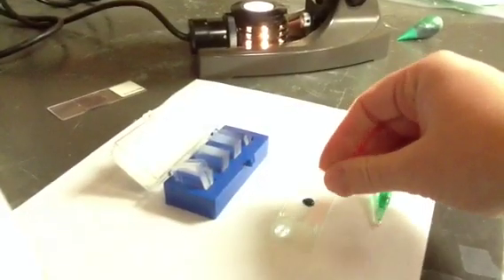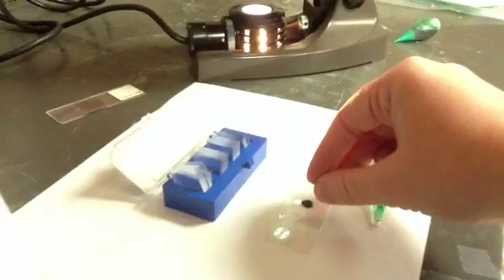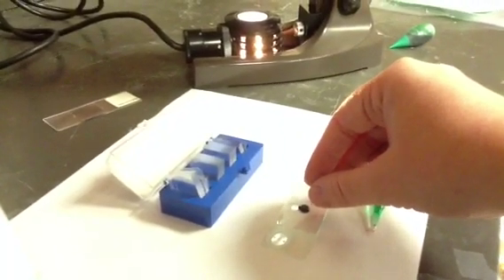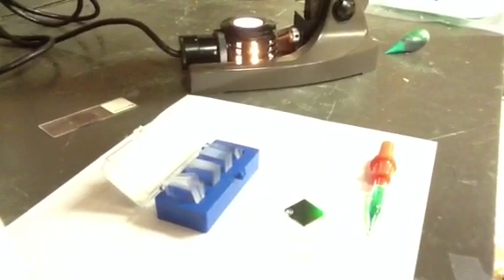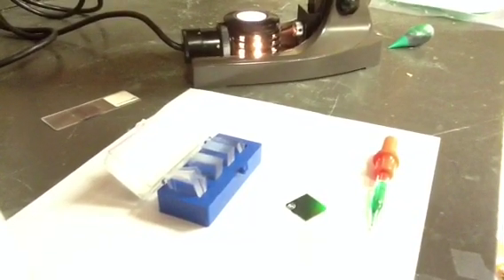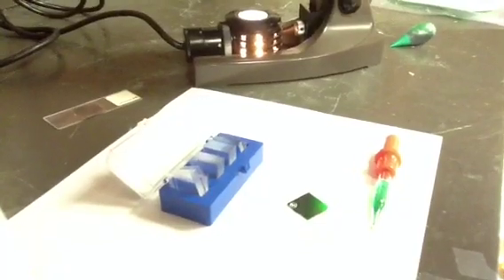It's important that you drop your cover slip at an angle instead of just straight on in order to get rid of air bubbles. Place the edge of your cover slip so it touches the slide, then let go of it. You can see the liquid that was underneath spread out. If you get too much liquid on there, it'll ooze out from underneath your cover slip. It also may make it a little dark and thick to see, so try not to use too much.